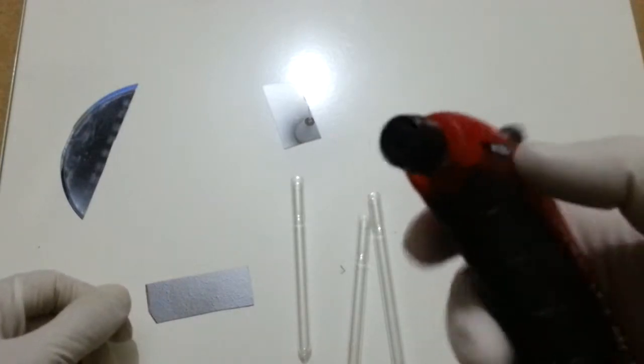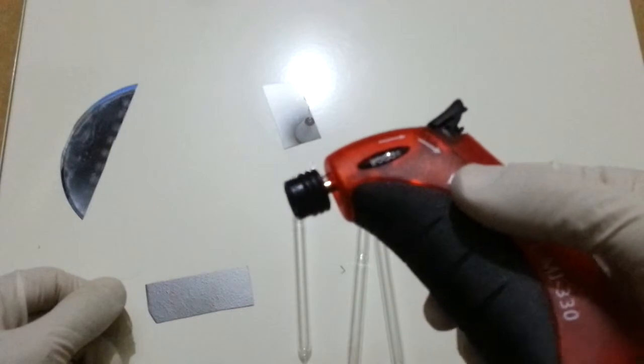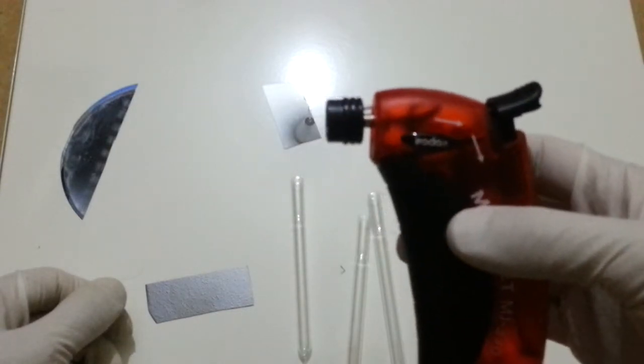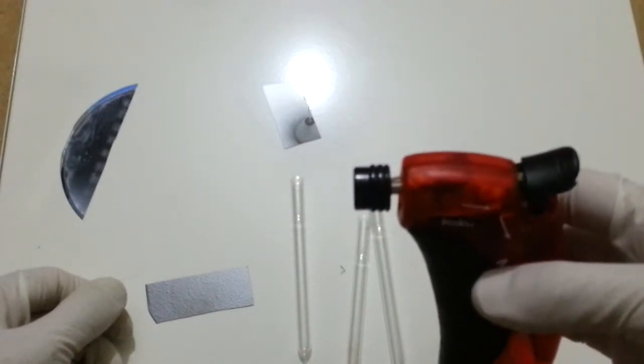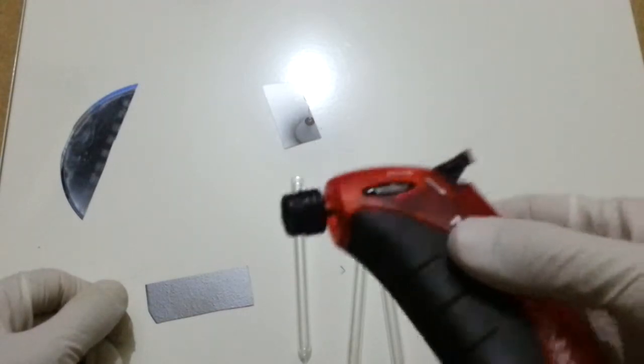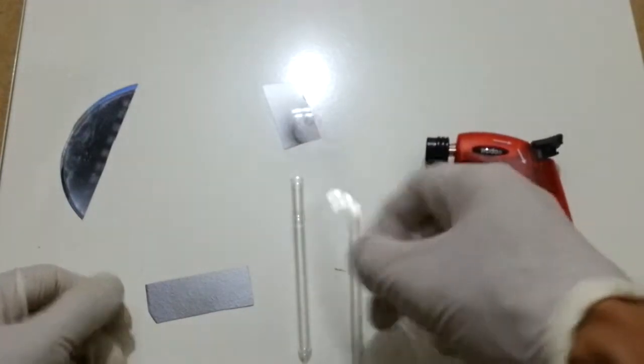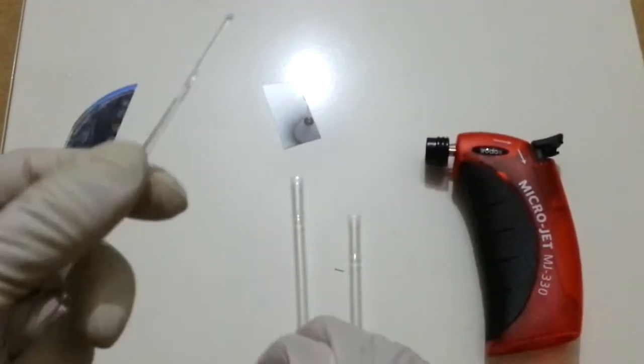And then you need a gas torch. A mini portable gas torch like this is sufficient because the walls of Pasteur pipettes are so thin. This is enough, and this costs $5 or $6 from China.